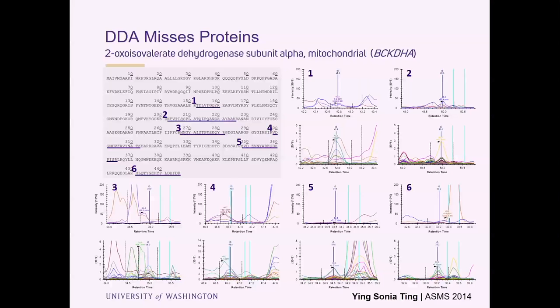And that also meant that we're enriching. So we're now putting our million ions in the Orbitrap from a five mass-to-charge wide window, as opposed to basically a 375 to 1400 mass-to-charge wide range.